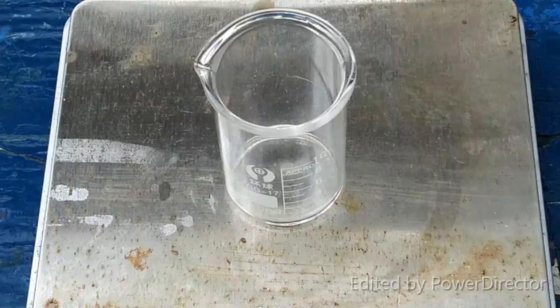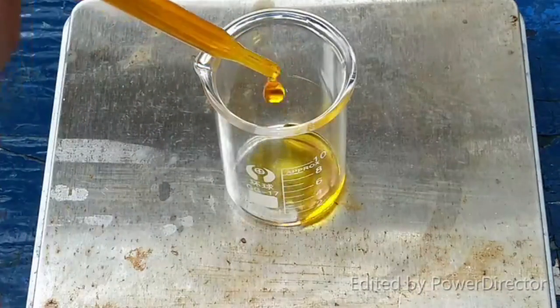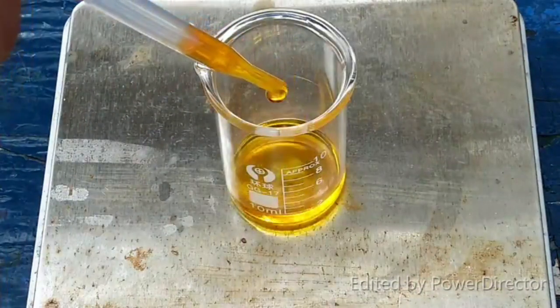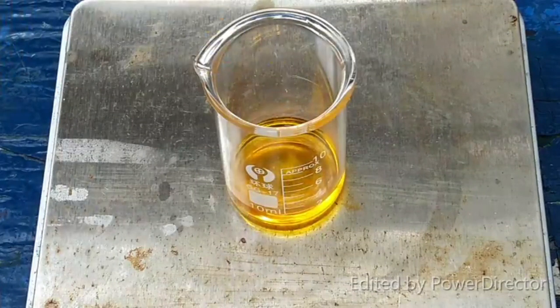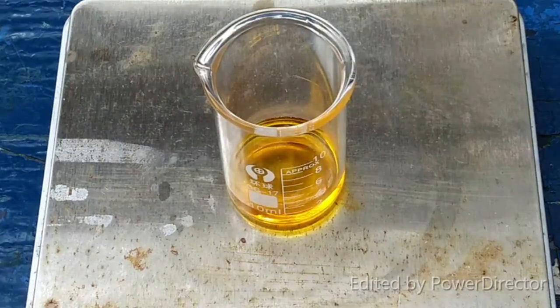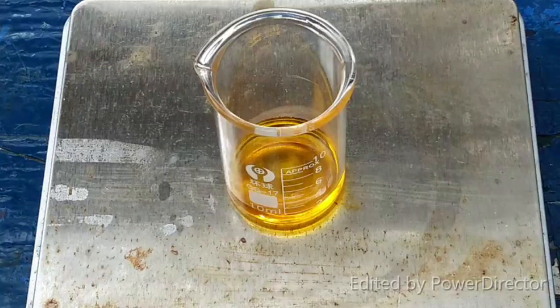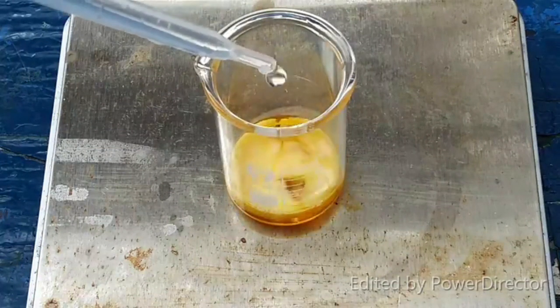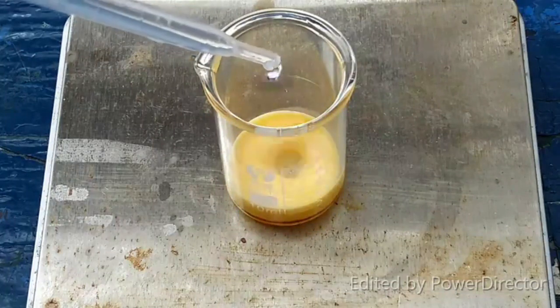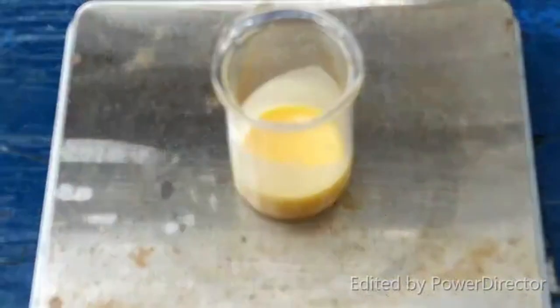Alright, so here we go. 1 milliliter of our hexachloroplatinic acid solution. So far, so good. Now, let me tare the scale and 1.54 milliliters of our cesium chloride solution. Oh, perfect. All right, let's give that a little swirl and let's take a look at that.